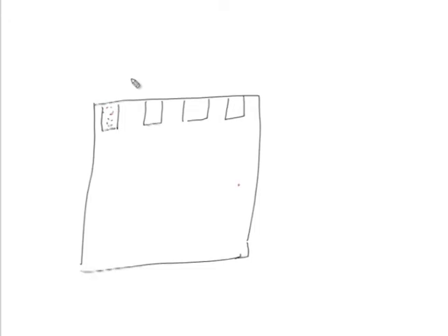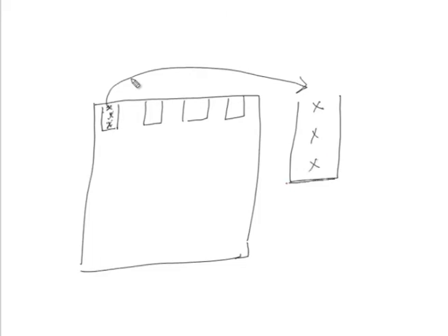Now if I just show you this here, if I have a sample at this place and this place and this place, let me show it here. Say this is your well where we are loading this sample. Now you have a sample here, here, and here, and this is the boundary, or the interface, from where the sample is going to enter the gel.